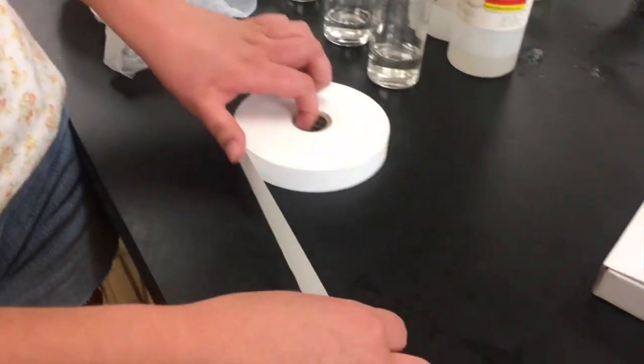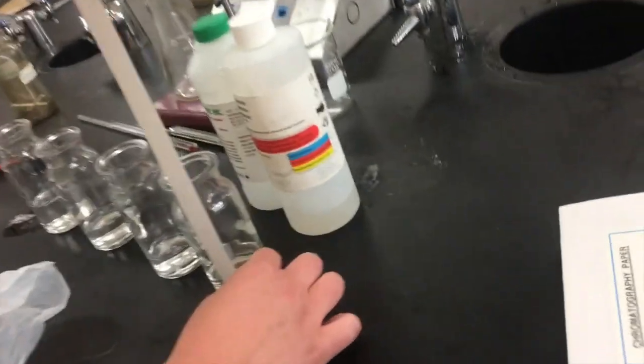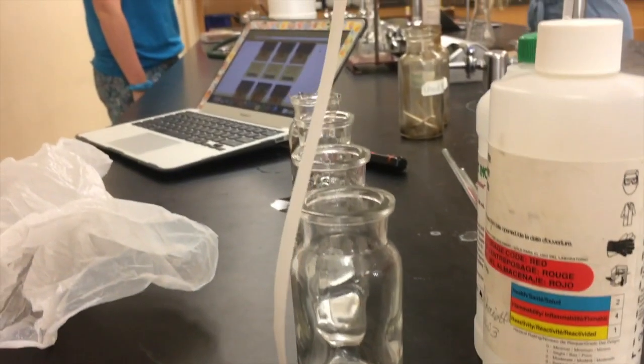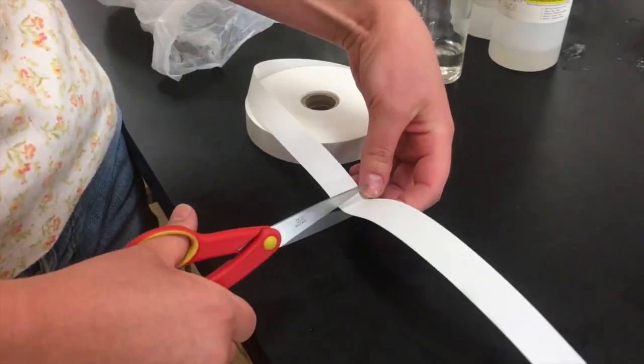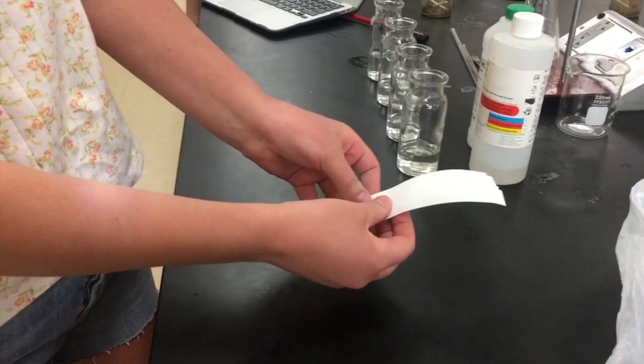So the length of the strips of chromatography paper should be a little bit longer than the height of the collection jar. So right about there looks to be good. And now we're just taking our scissors, we have safety scissors, and we're just cutting that off. Perfect.